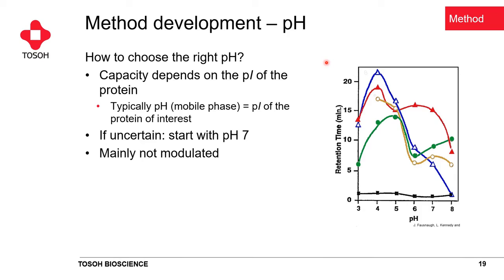Whereas the salt concentration and also the salt types are parameters that are often used to optimize the method, we now come to the pH that is less often varied in order to get a better separation. But I still want to say some words about the pH and how it influences our HIC separations. As a rule of thumb, what we typically do is we start at the pH that is the isoelectric point of our protein, which means our protein will be there in a non-charged form.